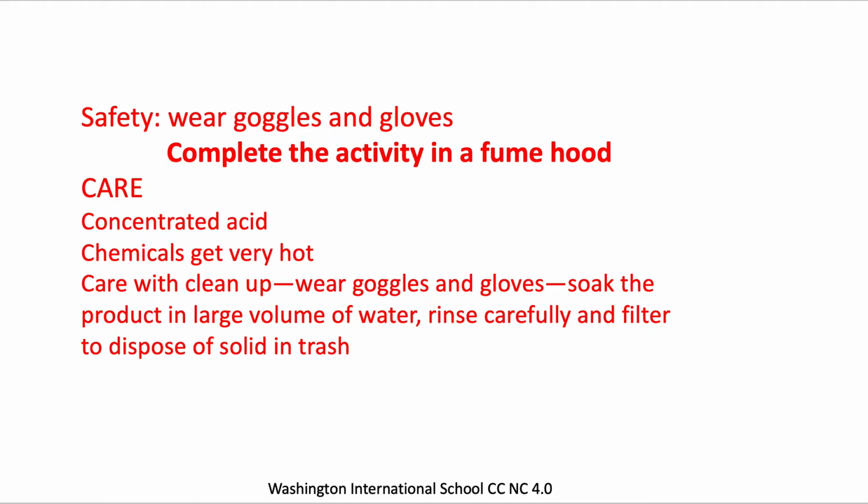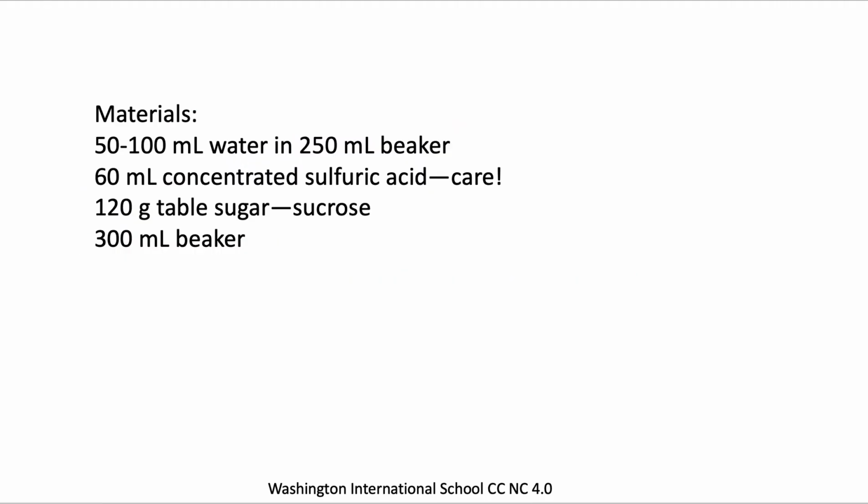And with the cleanup, keep wearing your goggles and gloves, soak the product in a large volume of water, rinse the solid carefully, and filter and dispose of the solid in the trash. Materials: small amount of water, concentrated sulfuric acid, table sugar, and a beaker in which to do the reaction.